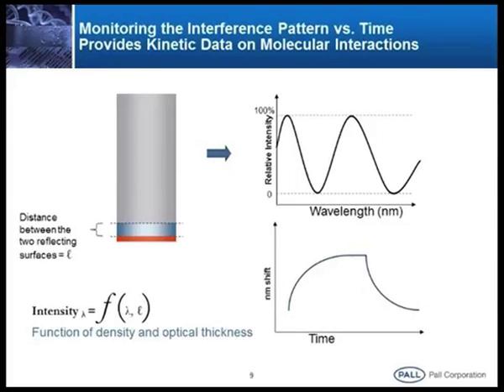What is the on rate? On rate is nothing but the association rate. Off rate is nothing but the dissociation rate. So dissociation rate by association rate gives the affinity. So we have to determine these affinity constants. If some proteins are interacting strongly, this affinity is called picomolar affinity. If there is a moderate interaction, say when an antigen binds to an antibody or a protein binds to a receptor, you will see the association phase.